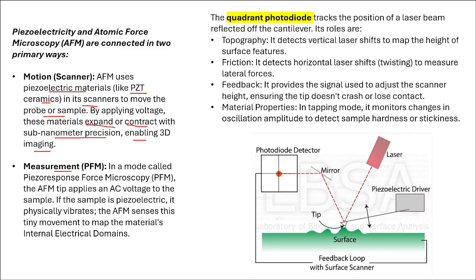Then there is a measurement mode called piezo response force microscopy, in which the AFM tip applies an AC voltage to the sample. If the sample is piezoelectric, it physically vibrates, and the AFM senses this tiny movement to map the material's internal electrical domains. So the basic concept still remains the same.